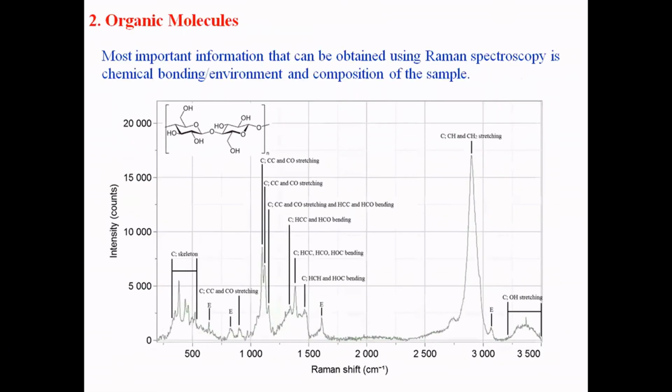And moving to the organics, of course, they have a very good functionality to scatter the electromagnetic radiation, and one can easily predict whether it is OH or NH or CC or CH. So that prediction can be done.